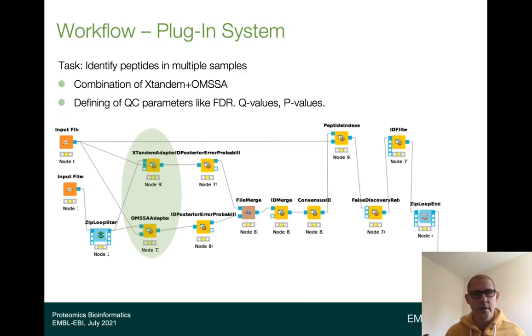What I am saying here in summary is that I will explain a little bit more about the nodes and so on, but the message to take from here is that you can really customize complex pipelines to analyze your data. This becomes more interesting when a more complex use case needs to be done, like proteomics experiments, or when you want to really go deep and identify more peptides using multiple search engines and so forth.